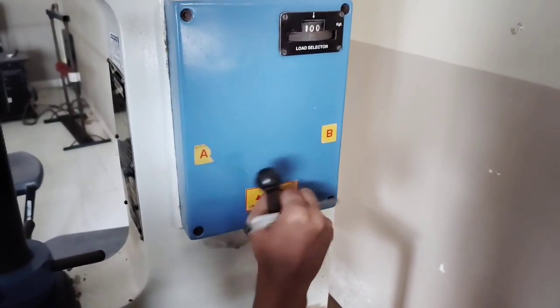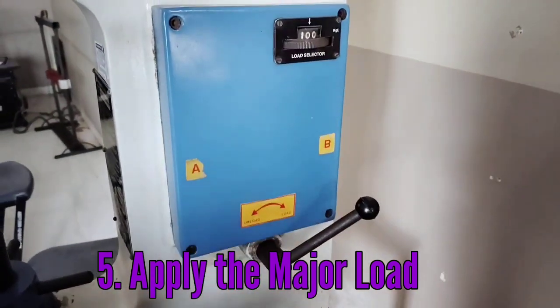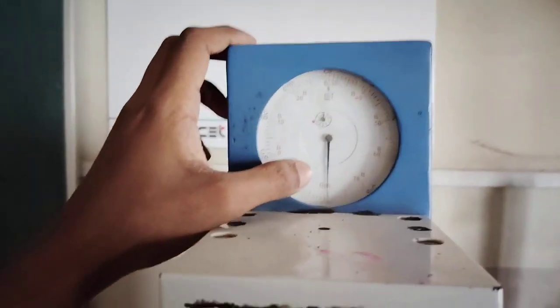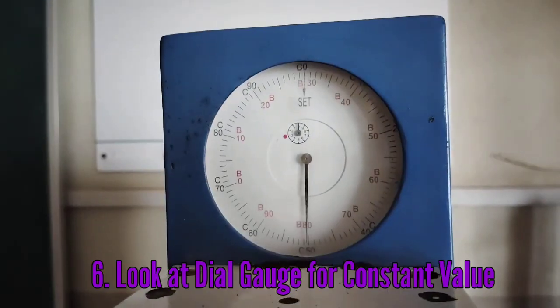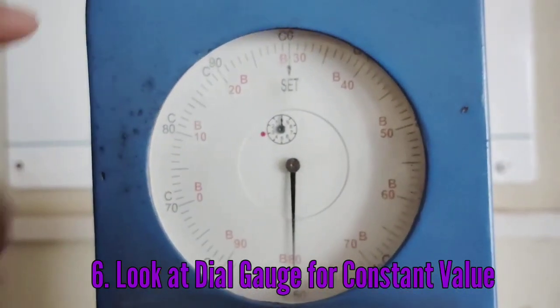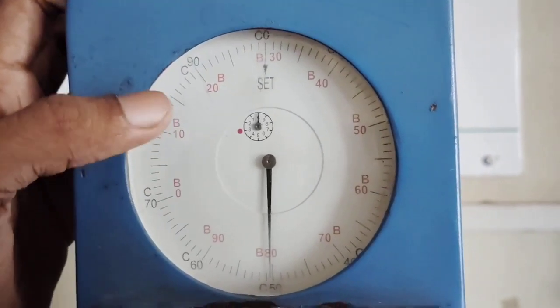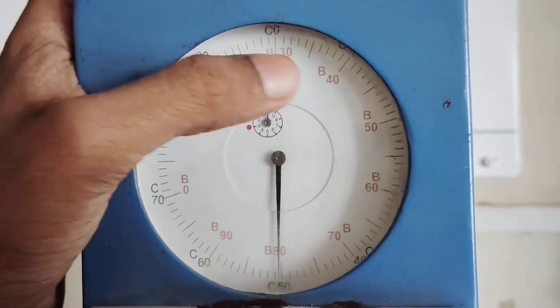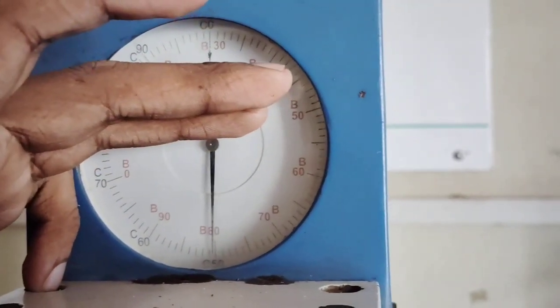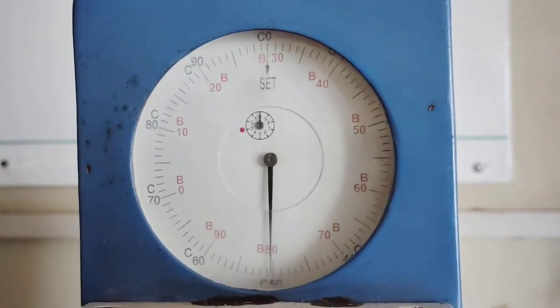We will apply the load of 100 kgf. Then we move to the dial gauge and look at the red dial. After looking at the red dial, we will know the readings. We will get a certain value, up to 50 or 60 or 70, and the rotation can be seen over here.